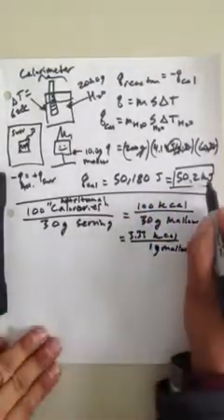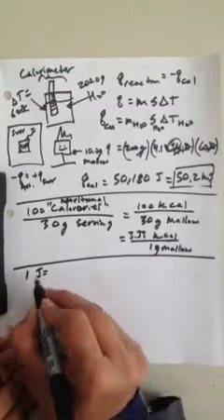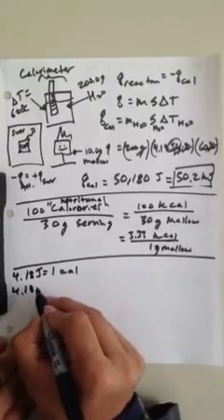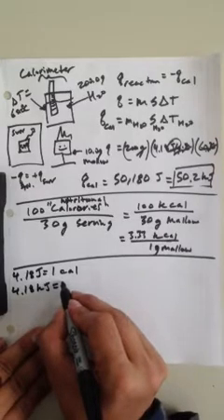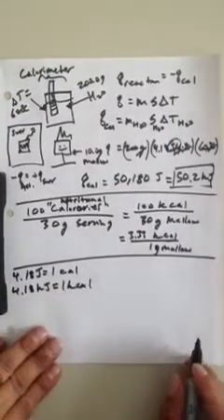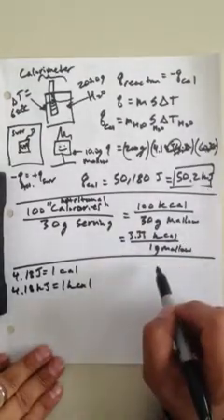Now we need to convert kilojoules to kilocalories so we can compare the two. The conversion factor is 4.18 joules is 1 calorie. And if I have 4.18 kilojoules, it's going to be the same as, so this is 1,000 of these, 1,000 of those is 1 kilocalorie. Okay? So there you go, FYI. So let's convert this kilojoules to kilocalories and see what we got here.